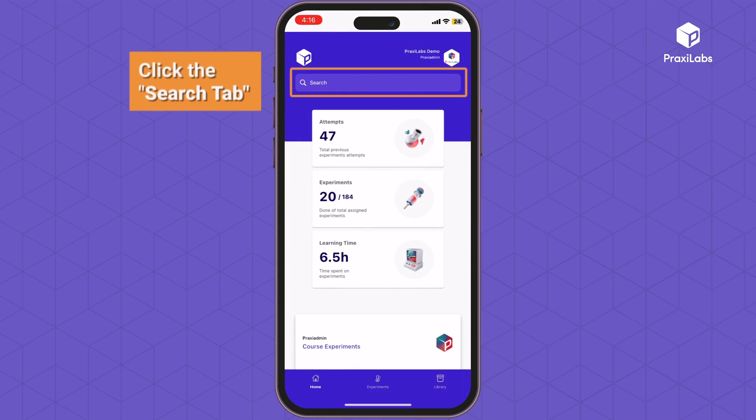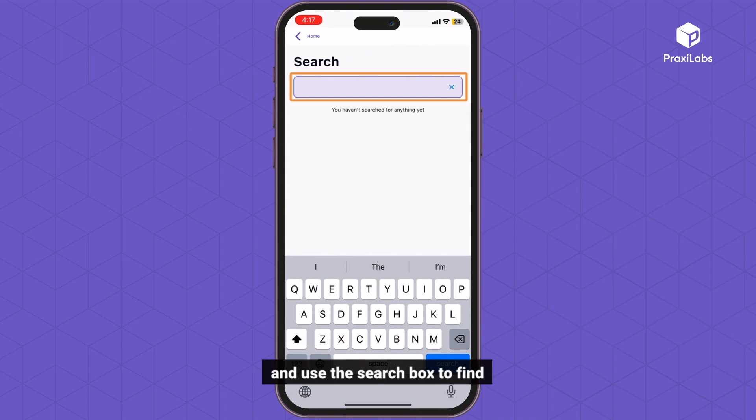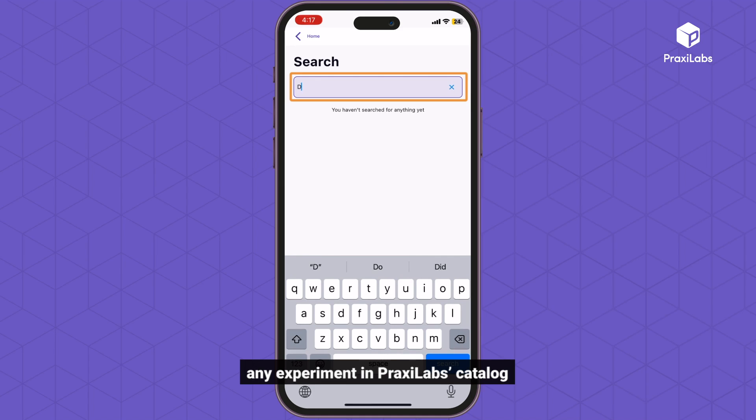Click the Search tab and use the search box to find any experiment in the Praxa Labs catalog.